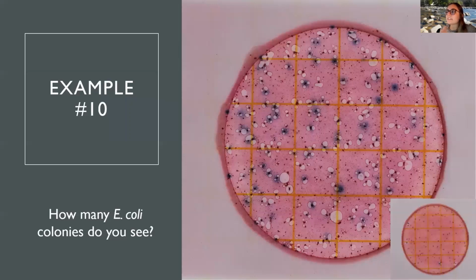Okay. And the reason why, for this situation where we're seeing the color change on the plate, is a little bit darker pink, we can still differentiate what's blue from what's red, is because on this plate there are a lot of bacteria, obviously, but there's not enough food, which is what the Petrifilm plates are serving the purpose of.